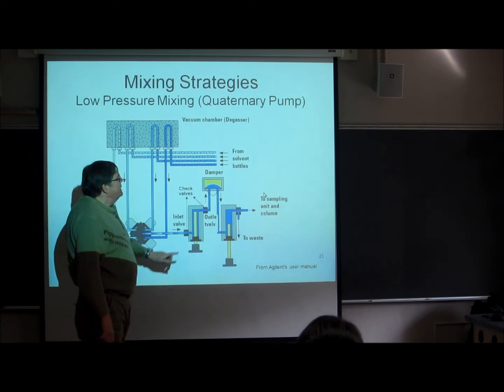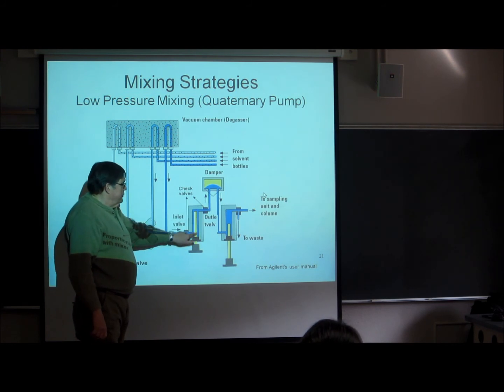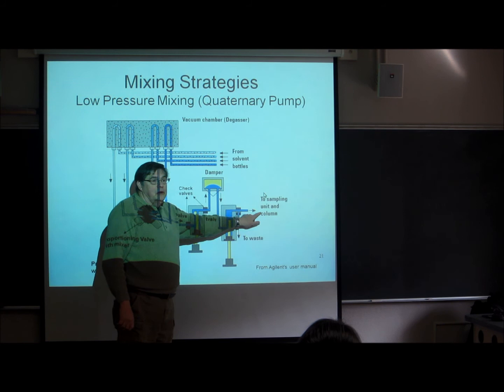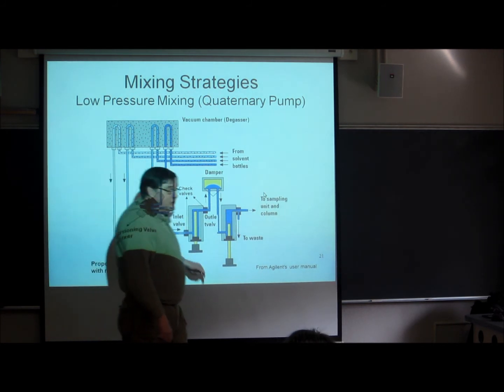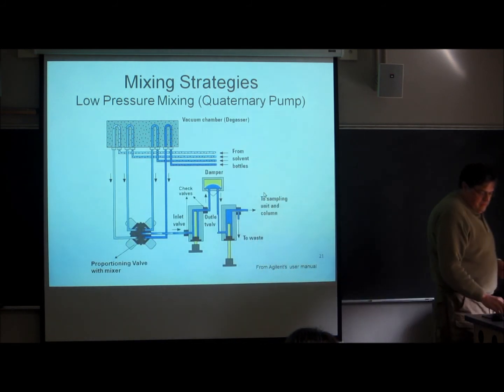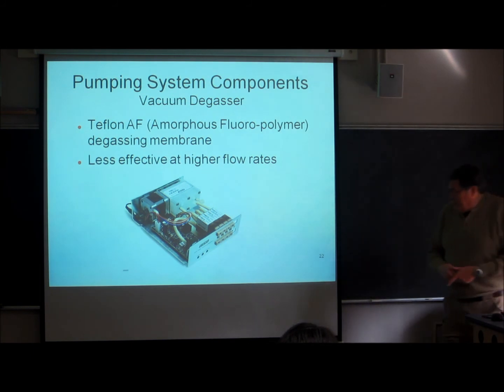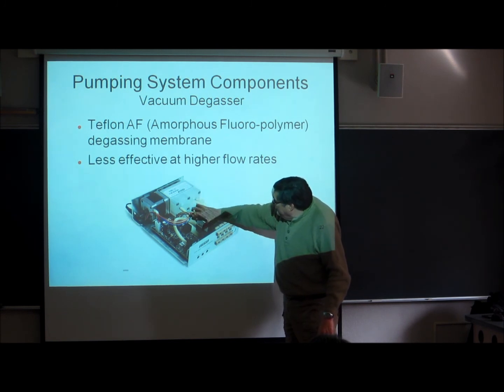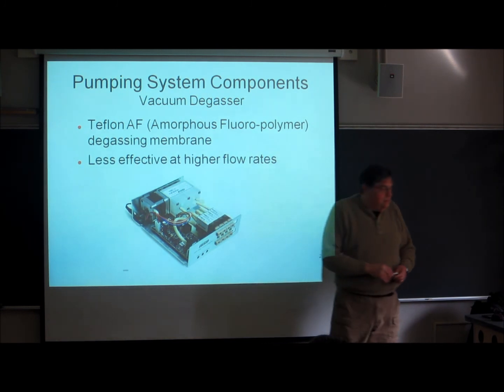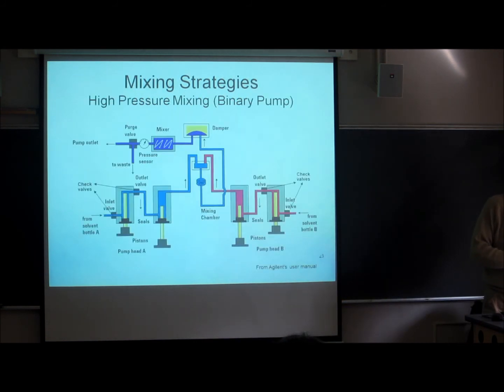Selecting the right mixture from the valve, and then pressing it outward. Okay. And while we're going on here, you can probably see that this first chamber serves as a pre-mixer for the final. There's mixing in this chamber, so you actually get some benefit from extra mixing in this. Here's a degasser, a commercial one. You can see the Teflon tubes that are in here, and this is evacuated. The whole unit's evacuated. You don't have to use those things, but it sure is convenient.